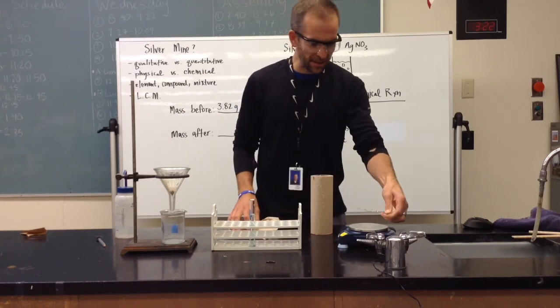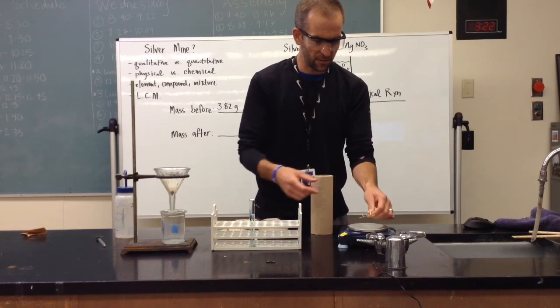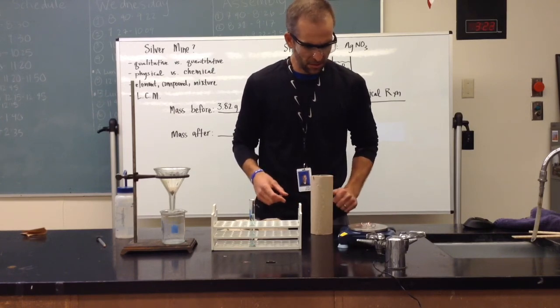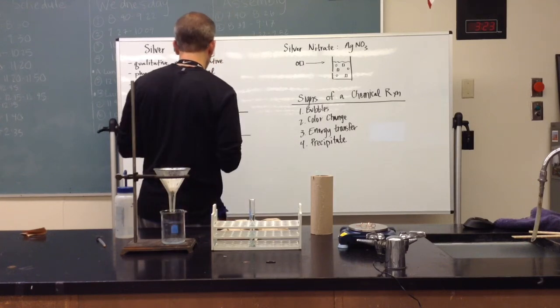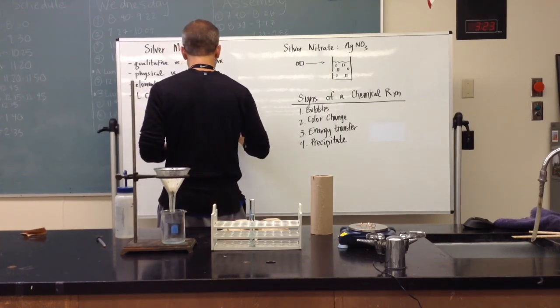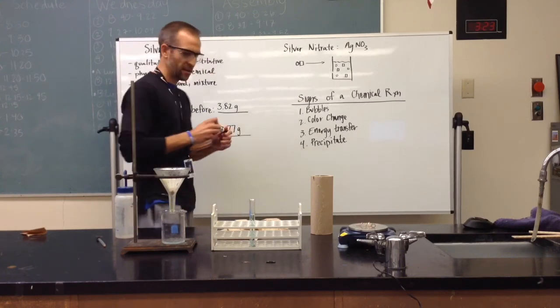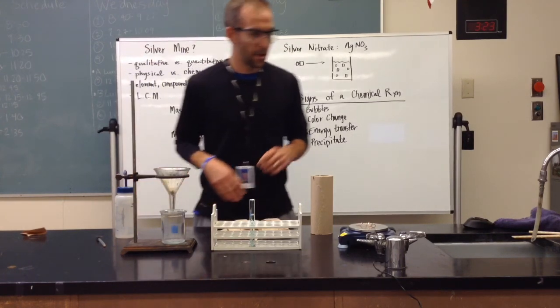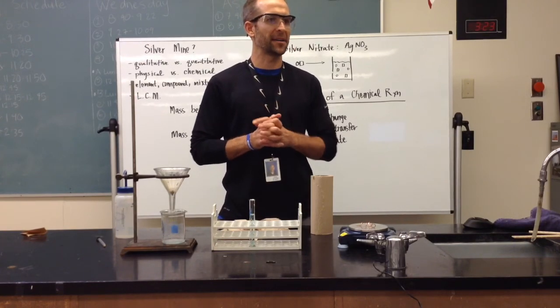I'm going to take its mass now. I'll make sure it's on there, not away. This mass says 3.77 grams. We've seen a mass change. We've seen a decrease in mass.